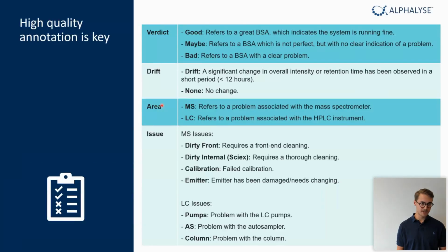So to develop this, one of the key things is actually understanding the data and understanding what you actually want to get out of it. So you need to collect all of this data, and you need to annotate it based on what you actually want to get out of it. So you really need to think about what is good, what is bad, what do I want for this machine learning model to actually classify based on.